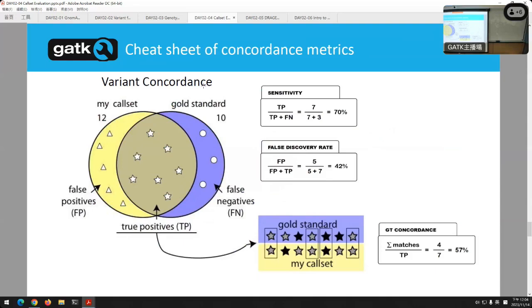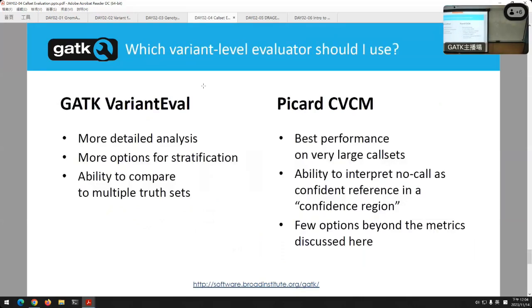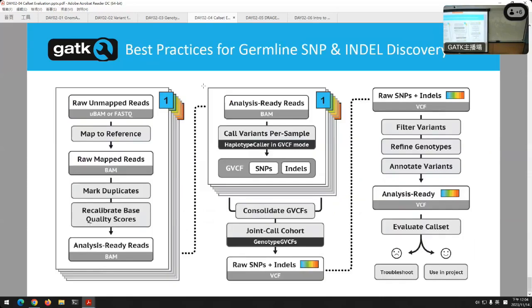All right. Because you have the slides, I don't have to go too much into the actual commands here. There are tools in Picard or inside of GATK, and we actually talk about why you might want to use one versus the other. But in the interest of lunch, I don't have to read everything on these slides. You have them yourselves. But again, those are basically four types of statistics that you can run. And when you're done, ideally, you look at your numbers and, if you've chosen your truth set right, you say, I know everything isn't 100% okay, but I have confidence that nothing egregious happened. And you can go from there.